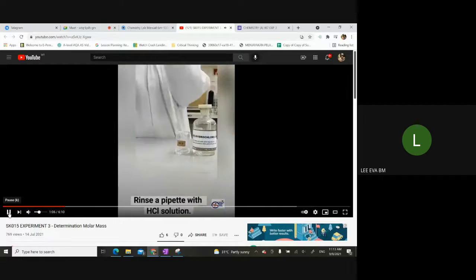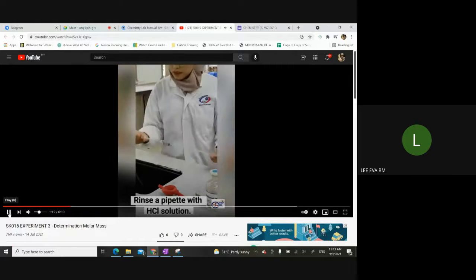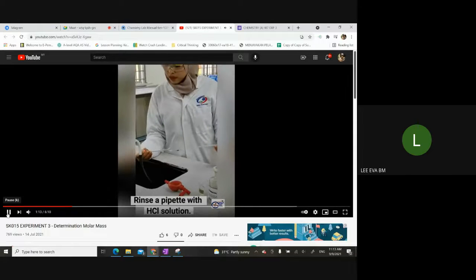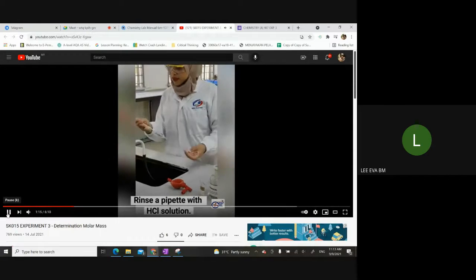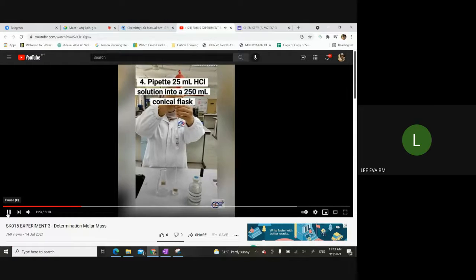Okay, so remember burette reading we always record in 2 decimal point. So next part we want to check the HCl solution using pipette. So recognize the pipette. Now the one with the tummy over here, it indicates a 25 milliliter pipette. Pipette kita ada banyak jenis. Yang ini adalah 25. So rinse it. And then after that, we take the full volume until 25 milliliters.